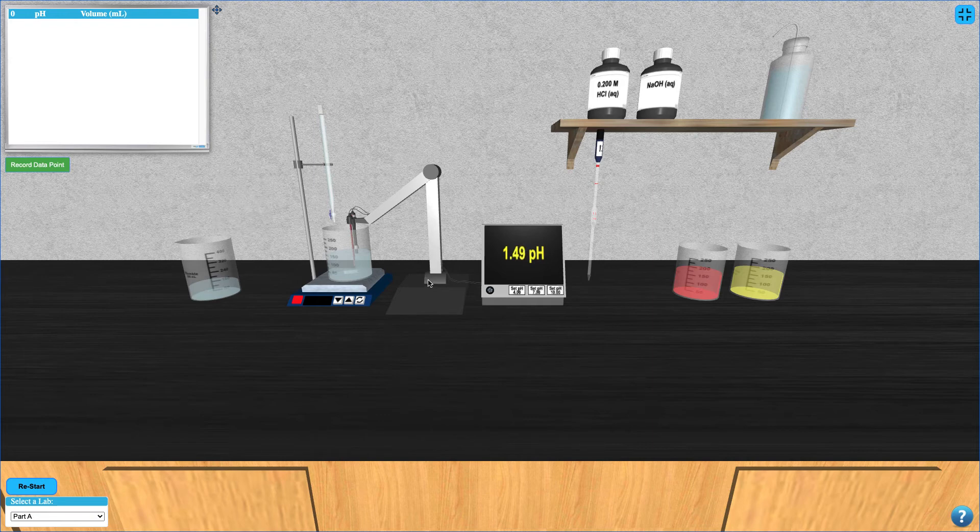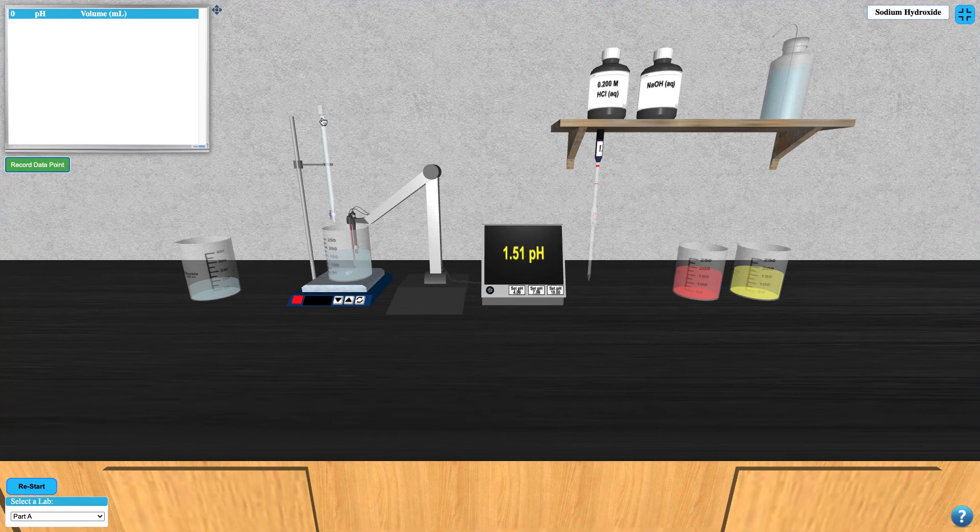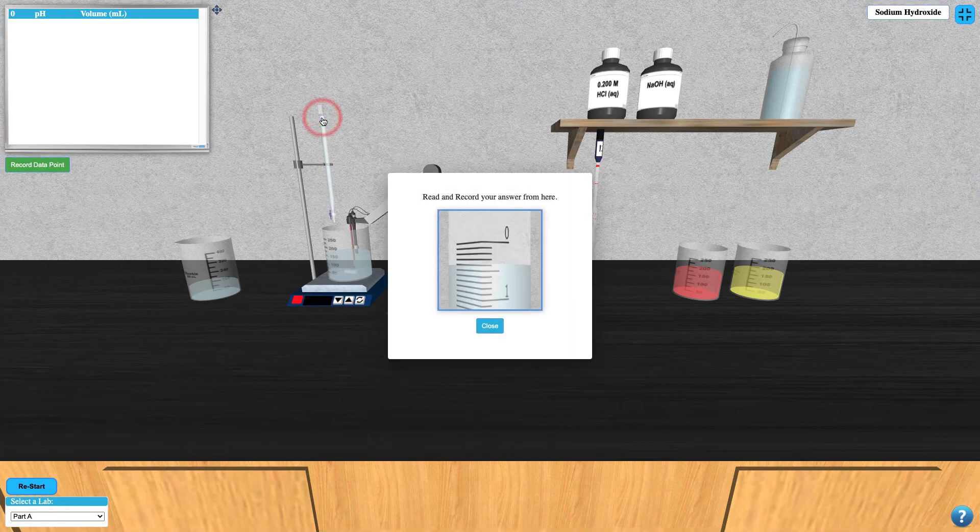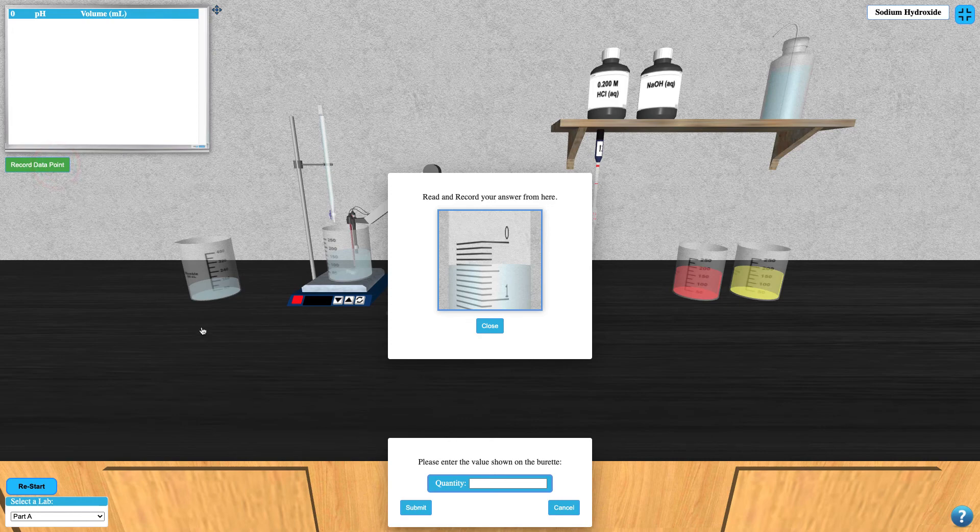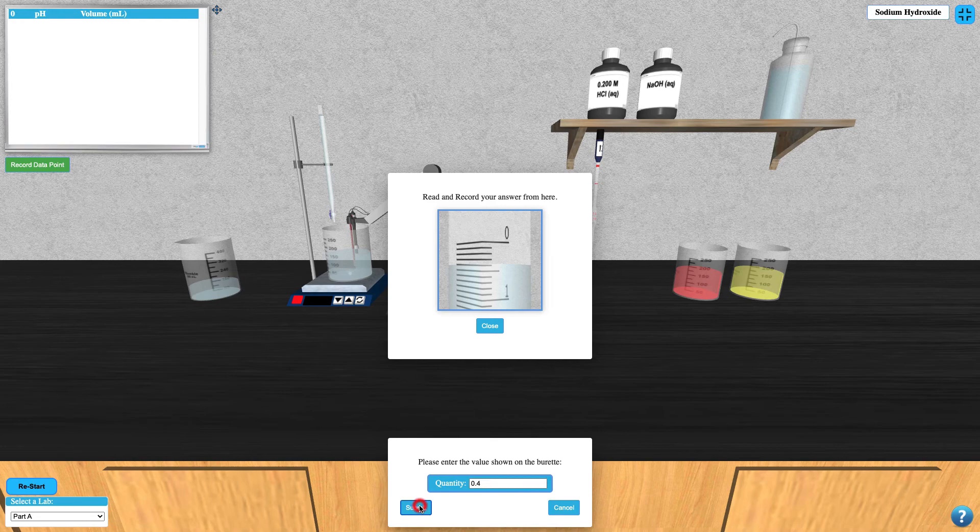To record a data point, click on the burette to zoom in on the graduations. Then click the record data point button and enter the volume. The pH on the electrode will be recorded in your data logger automatically.